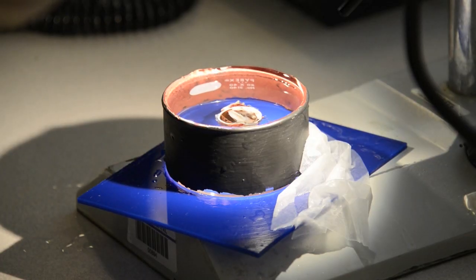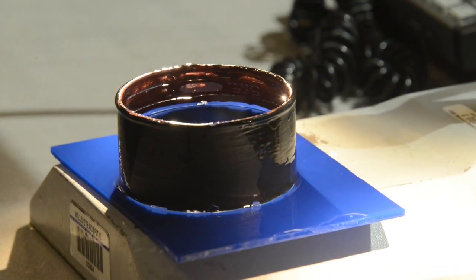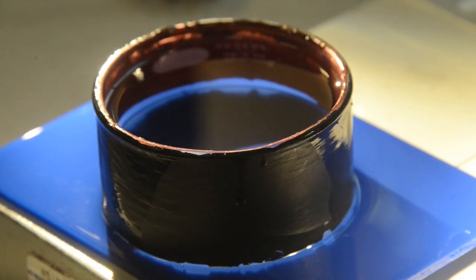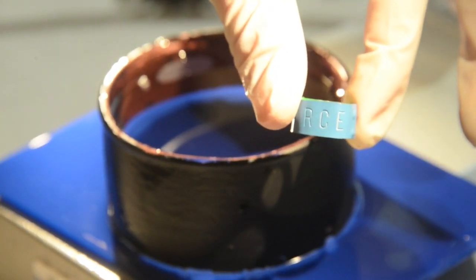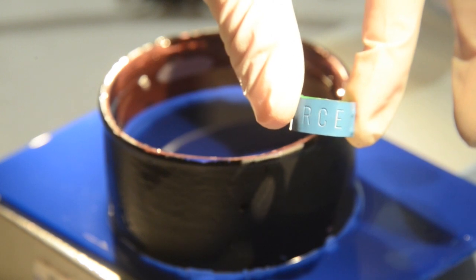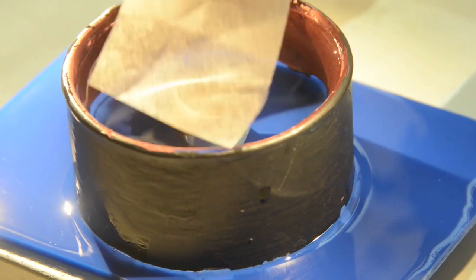During photography, the globe is immersed in a bath of 60% alcohol to reduce reflections from its wet surfaces. The dish is placed on the surface of a wet sheet of plexiglass to provide an aesthetic blue background. The bottom of the dish is coupled to the plastic with an additional interface of alcohol. During photography, the globe is positioned on a ring of soft malleable metal used for bird banding. The oil slick on the surface of the alcohol is removed with fine tissue.